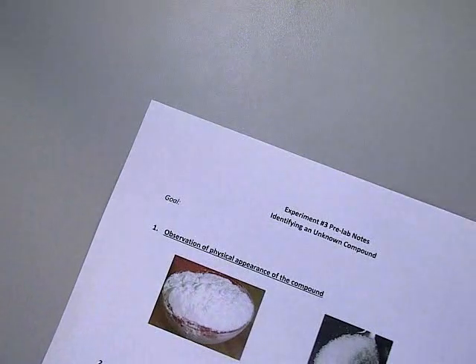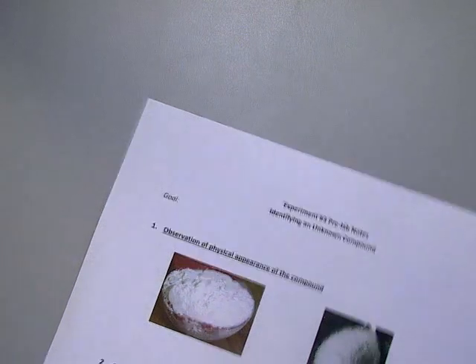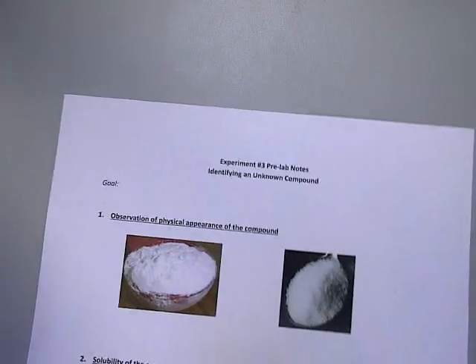Now let's move on to experiment 3 for this week. Experiment 3 is titled Identifying an Unknown Compound.